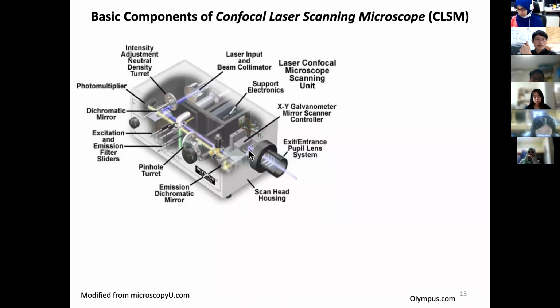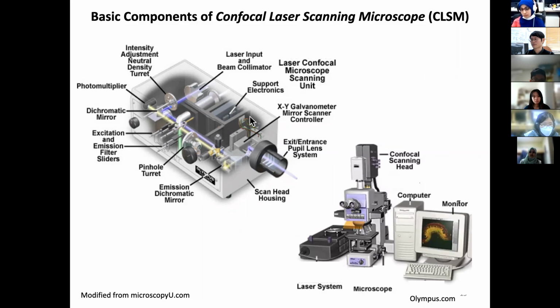After this scanner, it descans, which means it follows exactly the same path back. Now this is the descanned position. You have to put the pinhole at the right position of the focus, which is the confocal position. And after that, you can put your detector anywhere to get the signal.